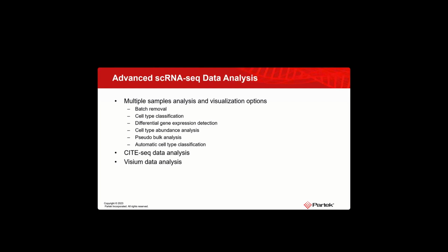After the single cell RNA-seq analysis, I will talk about the Cite-seq data analysis options in Partek Flow, and then Visium data analysis to show you how to analyze spatial transcriptome data.